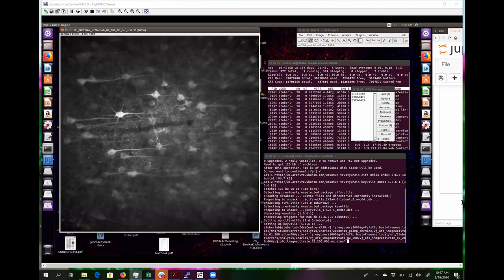If you're not going to be careful and really make sure that your analysis parameters are okay, independent of the claims, and then change them and make sure that the claims don't change, I think you can make pretty wrong claims. Yeah.